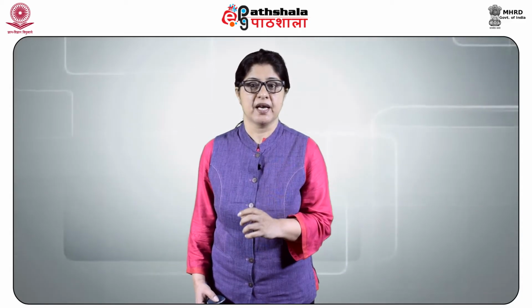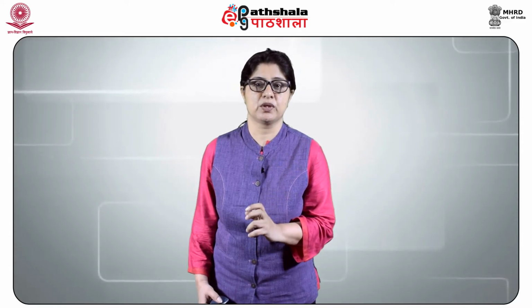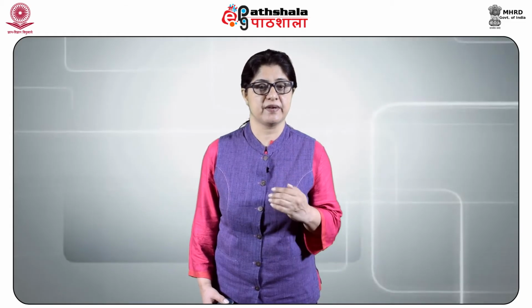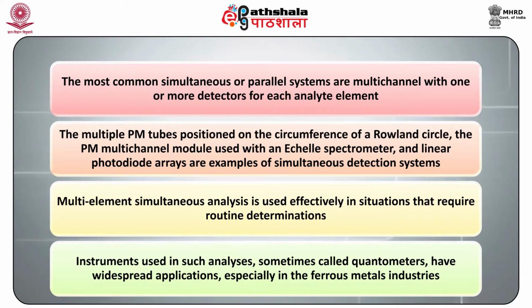Scanning monochromators have a grating or a mirror, usually controlled by a computer-driven stepper motor. Linear scanning, rapid slewing to preselected wavelengths and manual operations are possible with these devices. The most common simultaneous or parallel systems are multi-channel, with one or more detectors for each analyte element. The multiple PM tubes positioned on the circumference of the Rowland circle, the PM multi-channel module used with an Echelle spectrometer, and the linear photodiode arrays are examples of the simultaneous detection system.